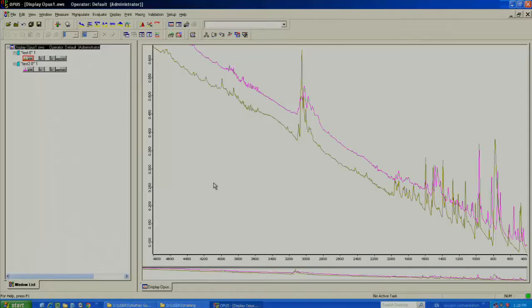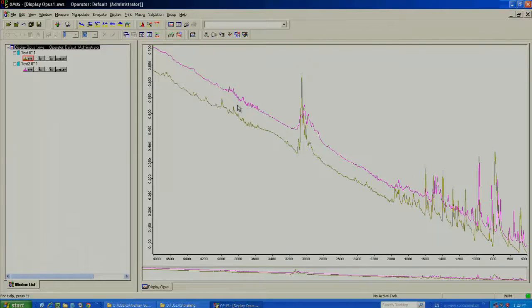Now you have a second pattern. When you don't have any more samples to run, you have to do two things. First, you have to convert the data into a usable format. To do this, make sure the ATR button of your first sample is selected.